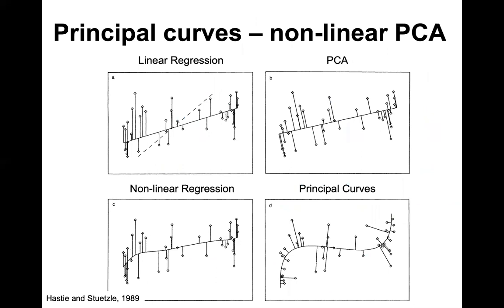Sets diffusion pseudotime, right? So that is a context where we're talking about graph walks and diffusion distances to calculate an ordering of cells from beginning to end. So I said this is one of the first methods to be described to do pseudotime inference. It's not the first. Monocle is one of the first ones. Actually, Cole Trapnell's lab coined the term pseudotime, but diffusion pseudotime sort of fits, I think, a little bit better within the framework. What we're teaching is important to understand.